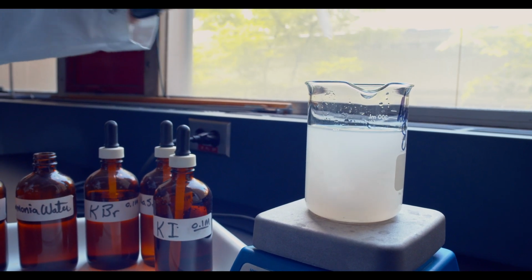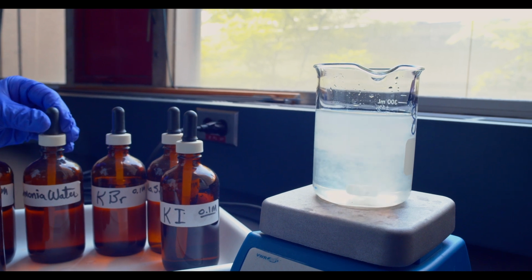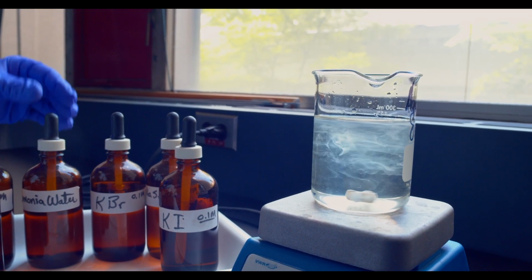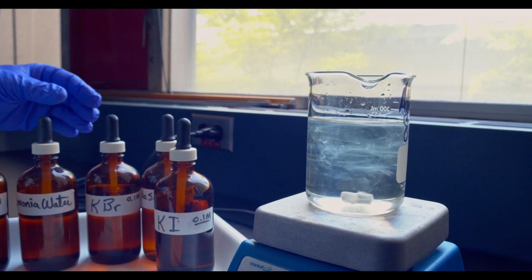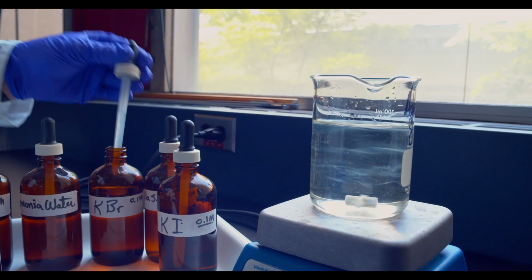We're getting close. You can see it's clearing up. So now we have a soluble complex of ammonia with the silver. And we go up in the silver solubility.